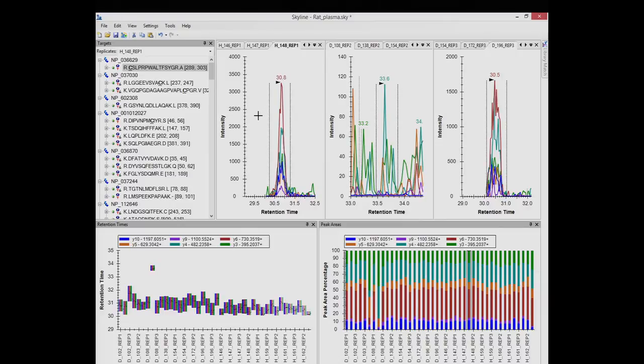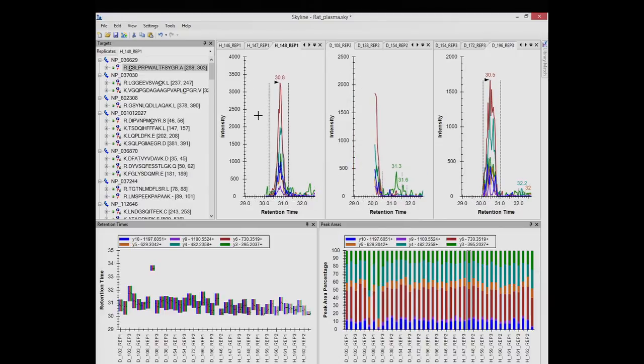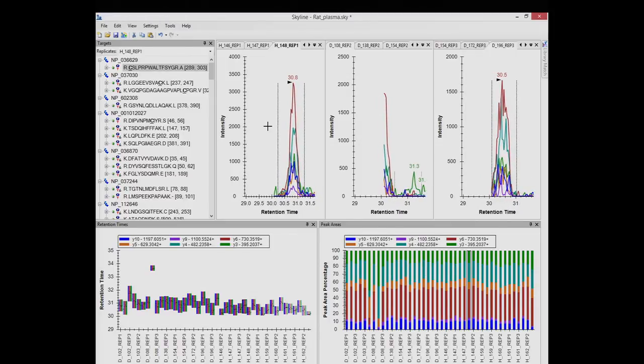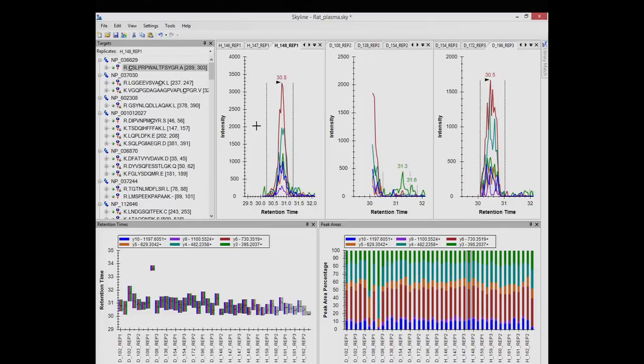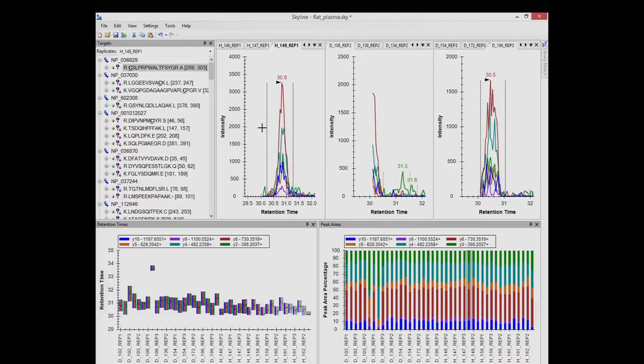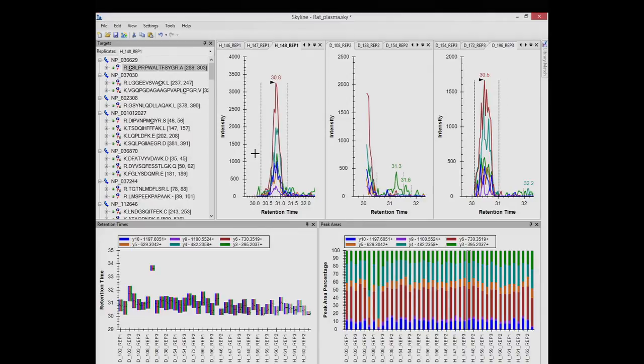And then if you just wiggle your scrolling, or you can use Control, Click, and Drag to pan. So you can scroll using a scroll wheel or the trackpad with two-fingered scrolling, or you can hold down the Control key and click and drag to pan things. And whatever you do now, Skyline will synchronize the other view to it.